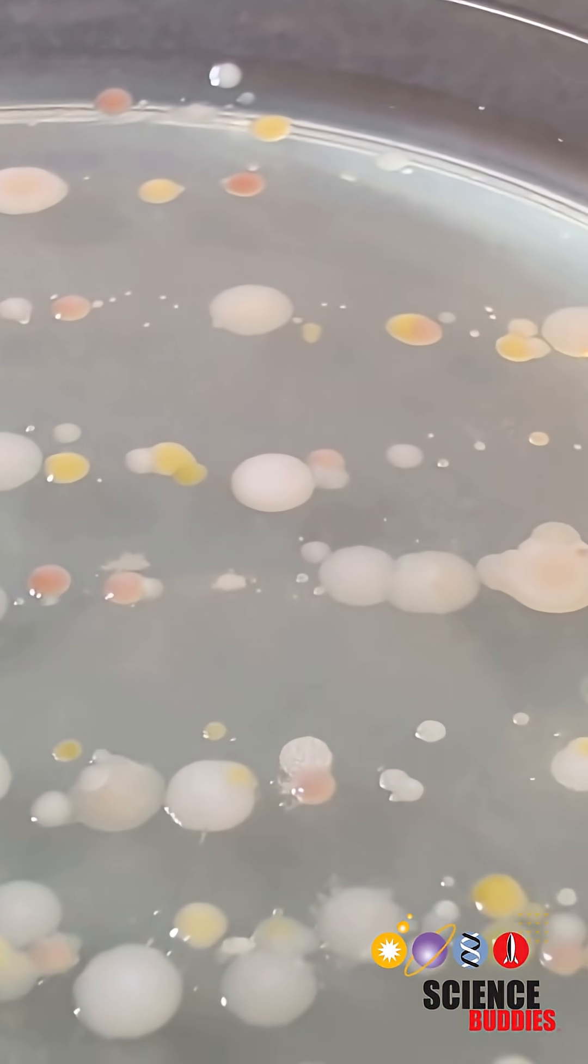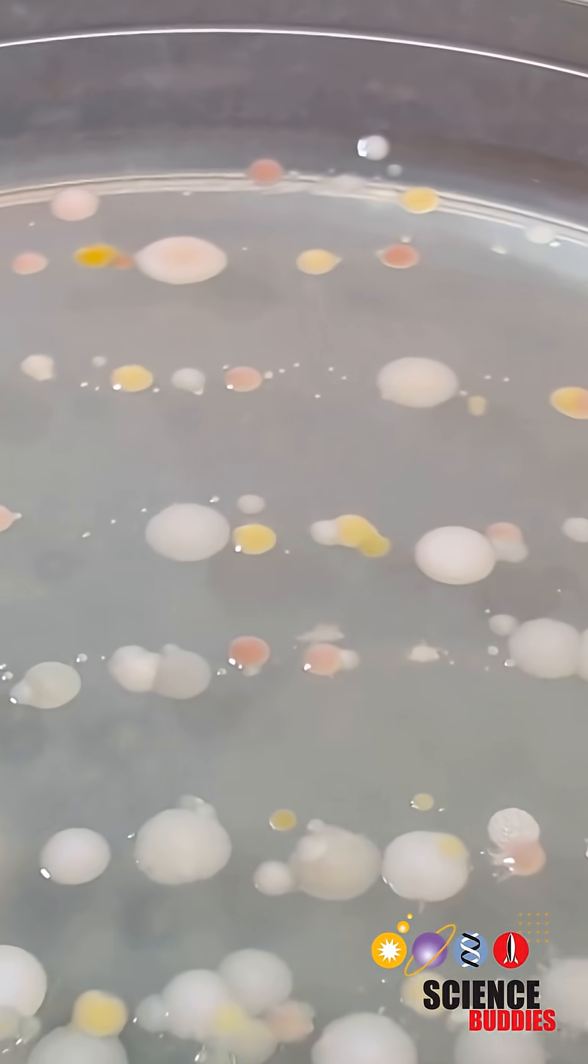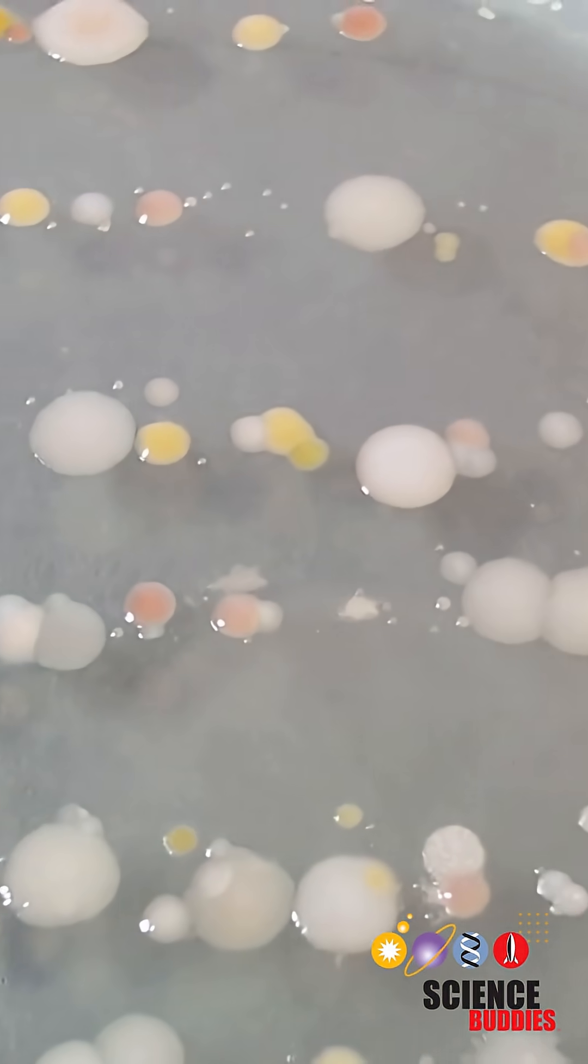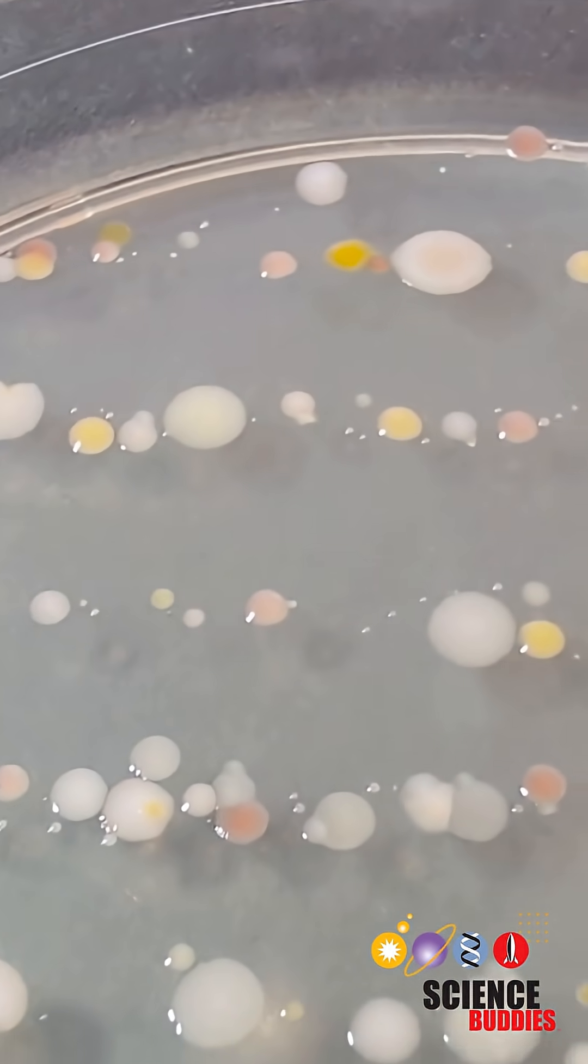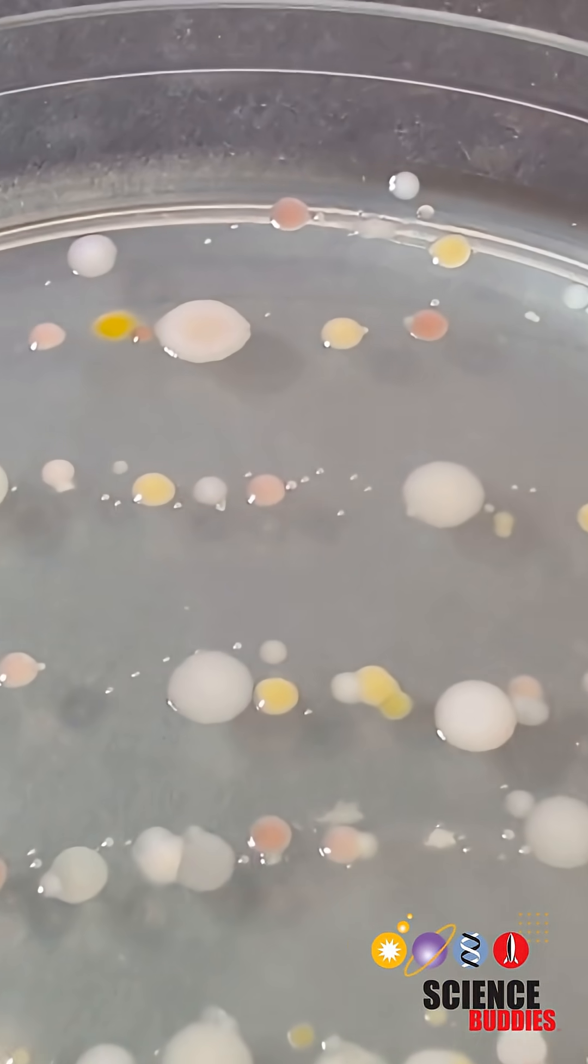So you should end up with colonies of microbes that look kind of like this. If you get colonies like this then it means that you successfully could grow the microbes after they were treated.